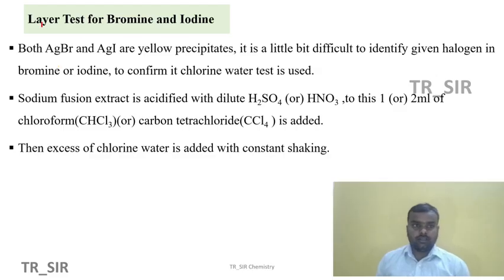The layer test is again for the test of bromine as well as iodine. Only bromine and iodine. So before going to the test for bromine, let us try to understand one small topic here.